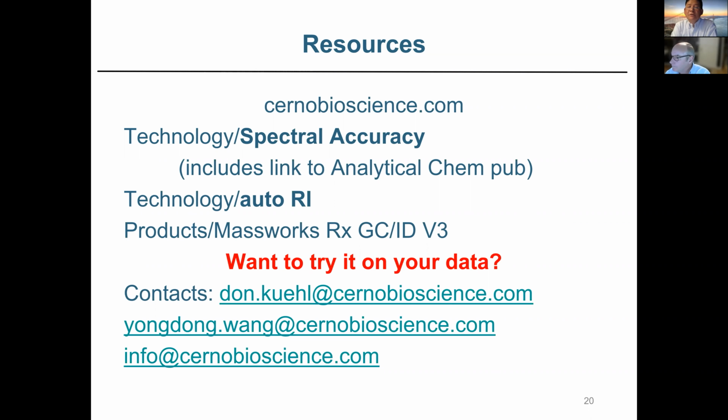Okay, there's another question coming. What if there's a novel compound that's not in the library yet? If you have a new compound, you've identified it, but it's not in the library, you can build a user library. In fact, our new version of the software lets you add that data into a user library. You do two clicks and it goes into the library.